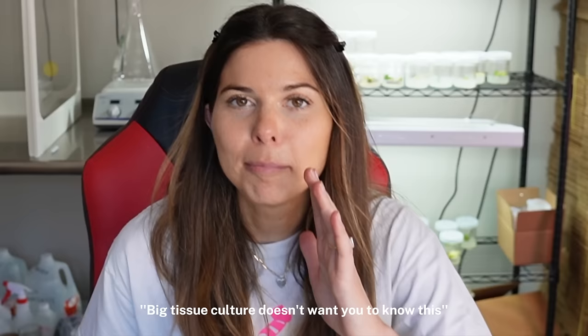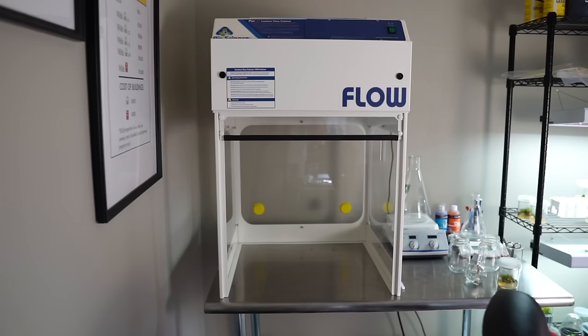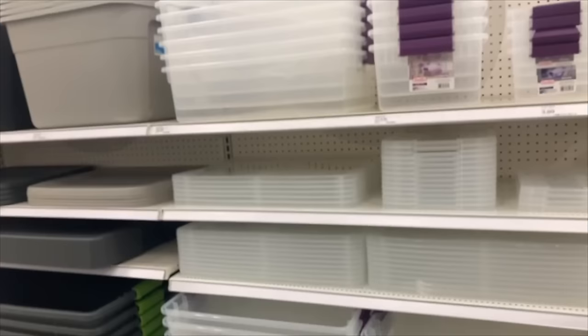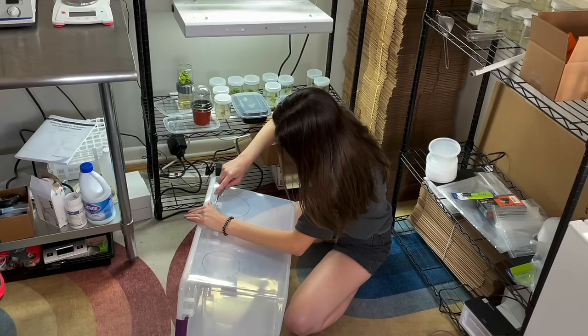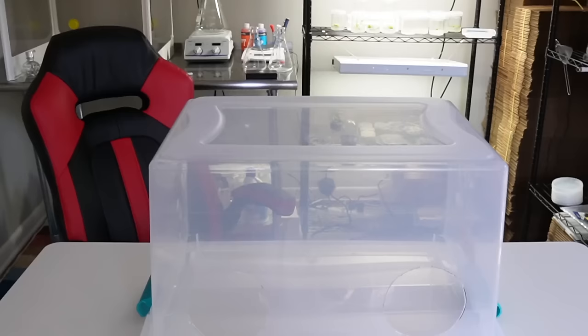Big tissue culture doesn't want you to know this. Today we'll be building a still air box, which is a much cheaper alternative to a laminar flow hood. I went to Target to gather the materials. For the still air box, you want a large clear container with a locking lid — the size doesn't really matter, but it needs to be large enough that you can stick both arms into it. I flipped the box over, traced two circles about the size my arms could fit through, and used a box cutter to cut them out. I also tried a soldering iron but didn't like the smell from the plastic, so I switched back to the box cutter.